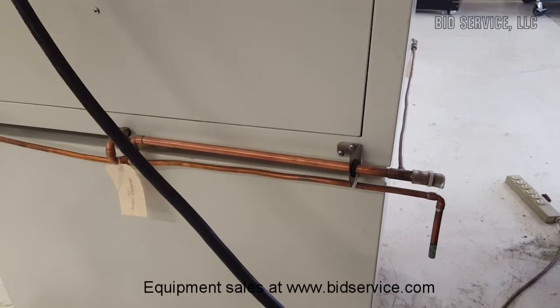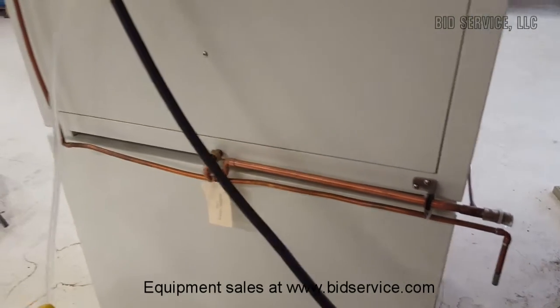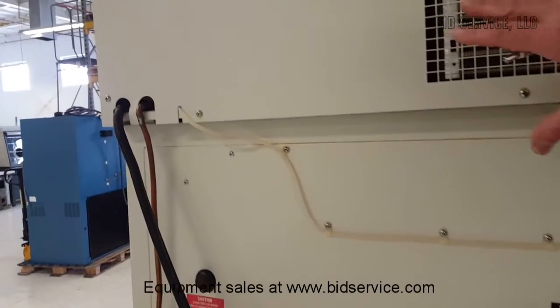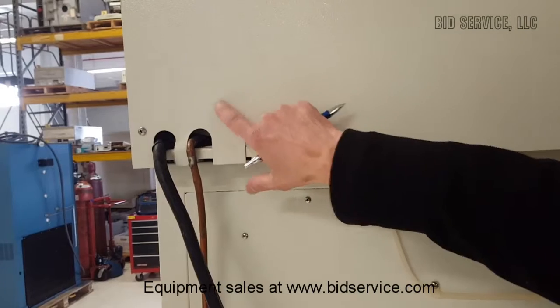I have it going into a five gallon bucket right now. This other drain line is for if you need to drain your boiler on top there, which is how you generate your humidity. You can't see it, but it's up inside of here.